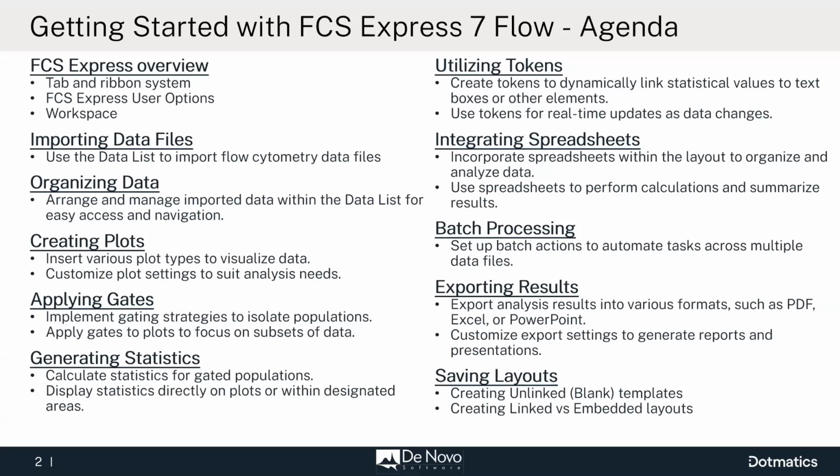And then when we're done with getting those pieces of the layout set up, we can talk about batch processing so that we can automate those tasks that you're doing at the end of your layouts, at the end of your analyses across all of your data files. And we can use that to export results to PDFs, Excel, PowerPoint, things like that, generate our reports, and get all of the analyses out of your analysis that you're looking for.